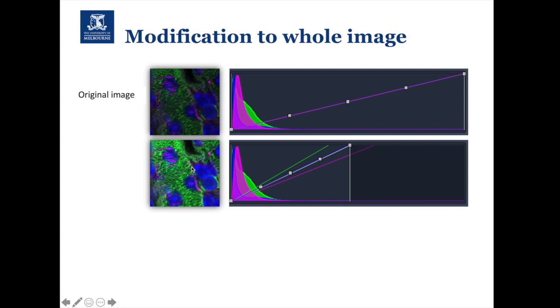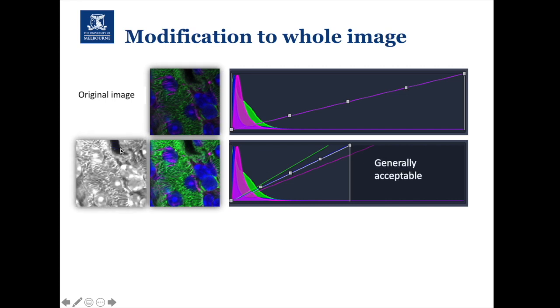So again, I should stress this is visualization only, not quantification. If you do this and hit apply, you're going to rescale all of this information across the full range. So here we've rescaled it. This is our lookup table showing a saturation. We don't have any red pixels here, so we're not hitting the data, we're not saturating any of the details.